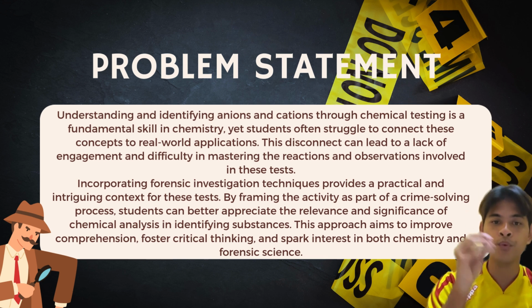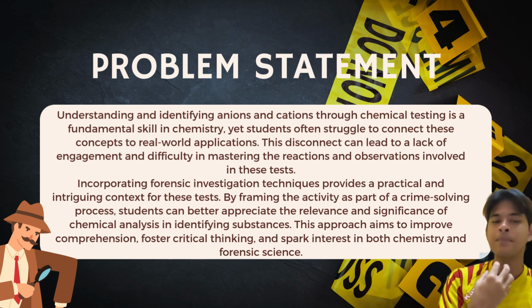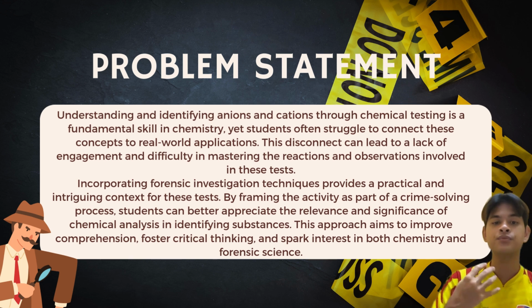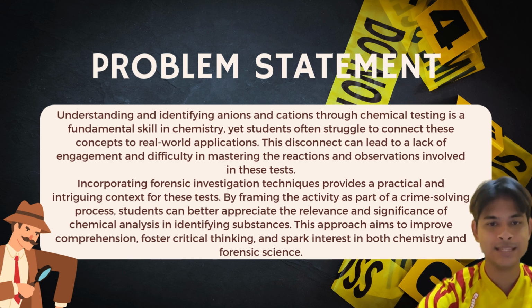That's why we invented this kit, so that students have a better and easier understanding by using a physical approach in solving the cases.